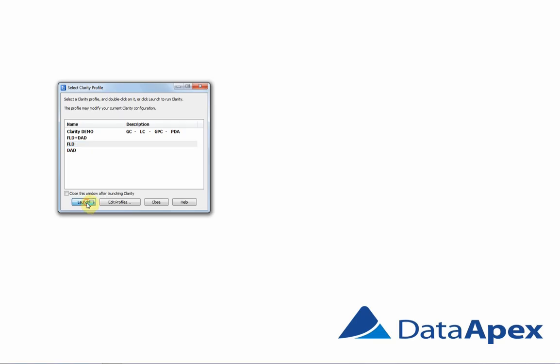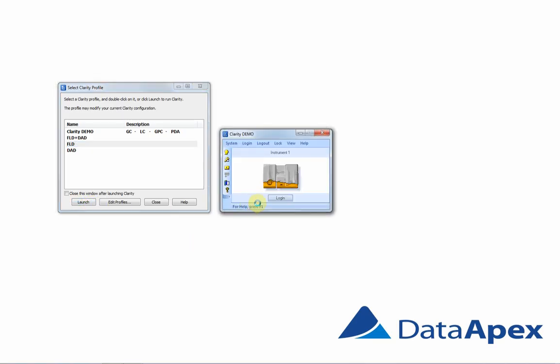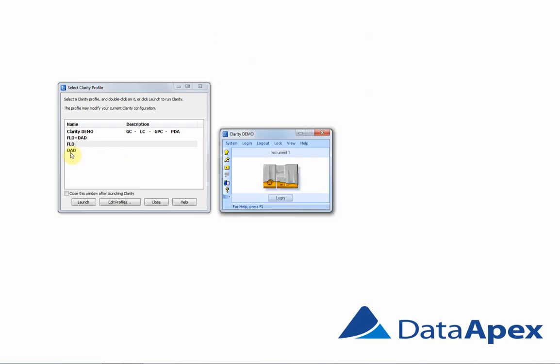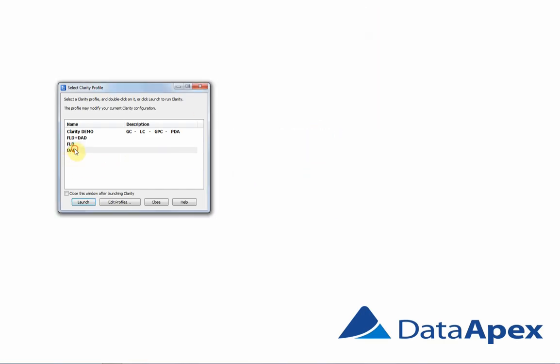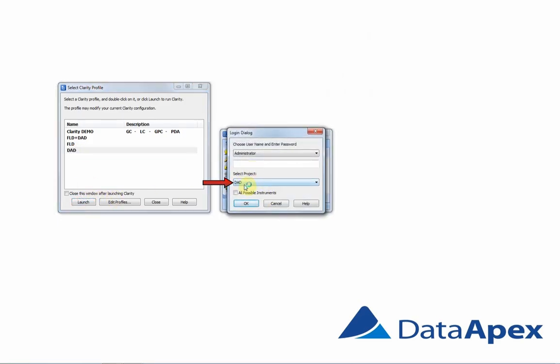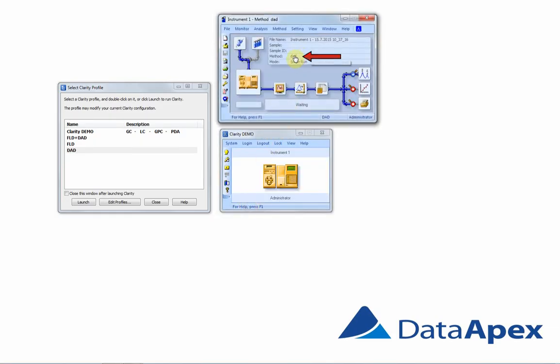I will launch the FLD. Again, correct project and correct method. So this is working correctly. I'll close it and test it with the last one, DAD. DAD has loaded DAD project and with the DAD method. So everything is working correctly.